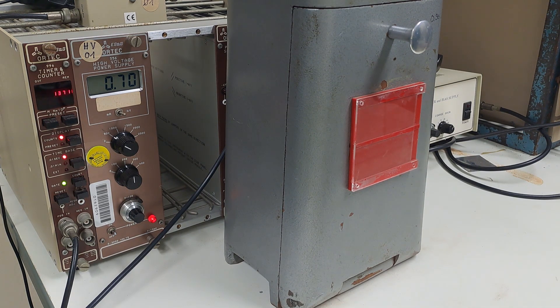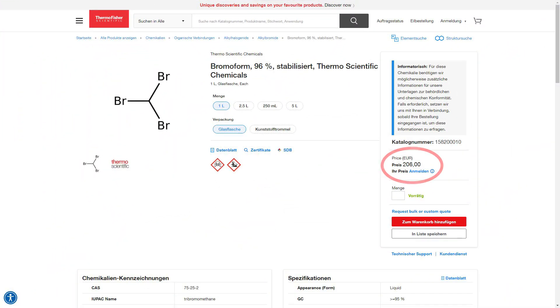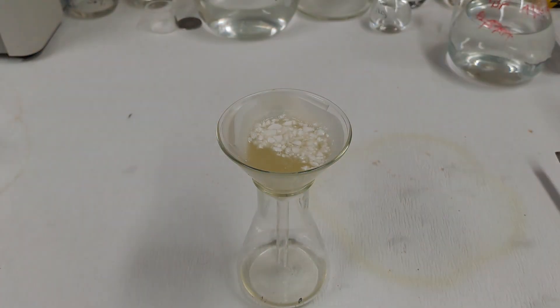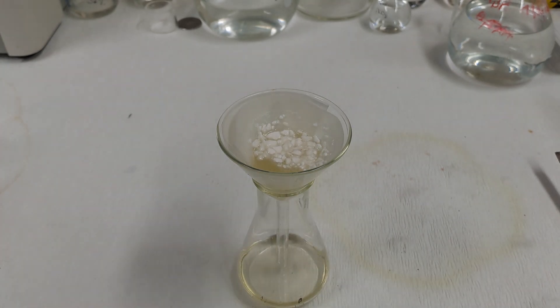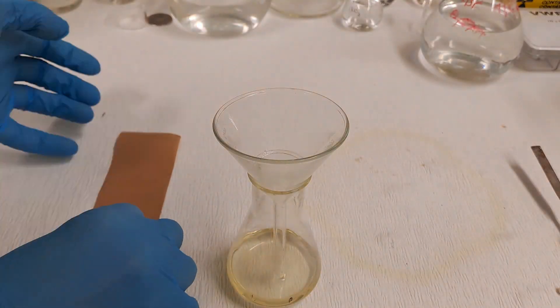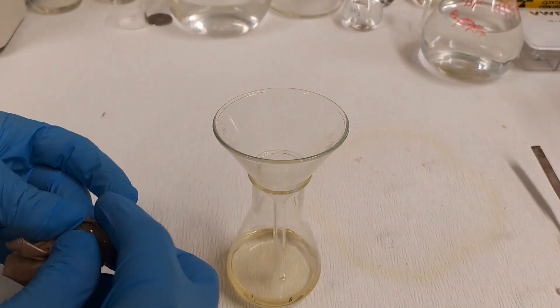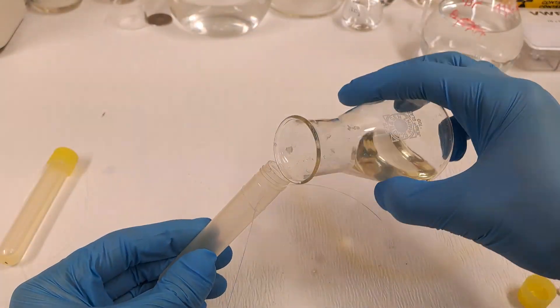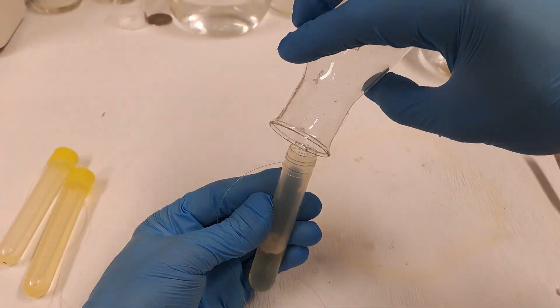The measurements are then plotted, and a background measurement should have been made beforehand. The background count is usually around 9 to 10 counts per minute. Bromoform is expensive — 200 euros per liter is still a fair price — so it gets recycled. The bromoform is mixed with calcium chloride and vigorously shaken until the color lightens; calcium chloride dries it. The mixture is then filtered and the filtrate returned to centrifuge tubes. The filter paper may contain contaminated calcium chloride, so it's wrapped in tape and put into bromoform waste to decay.